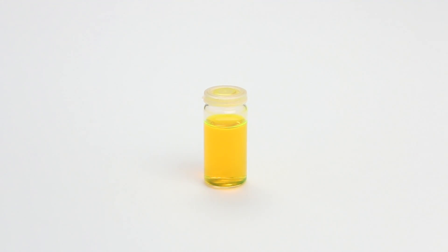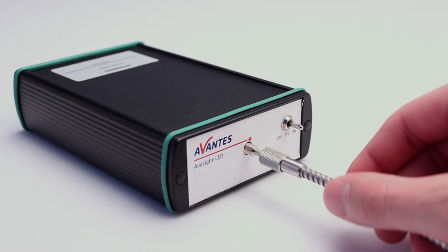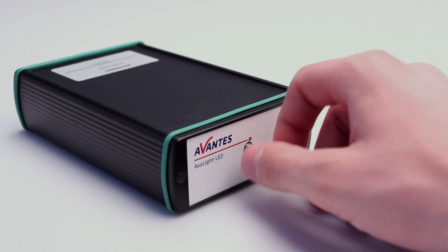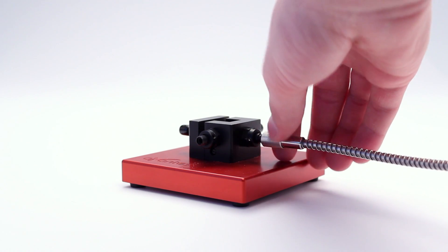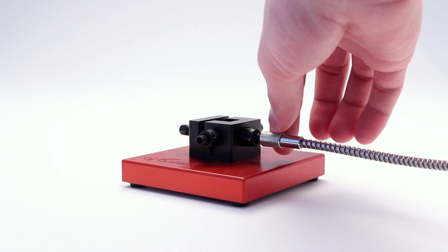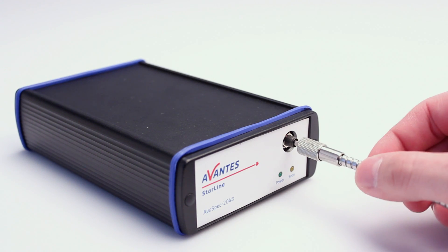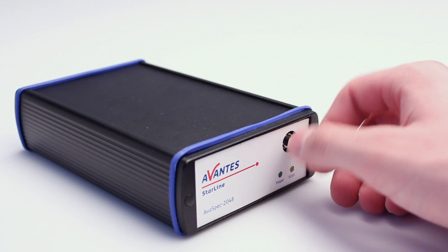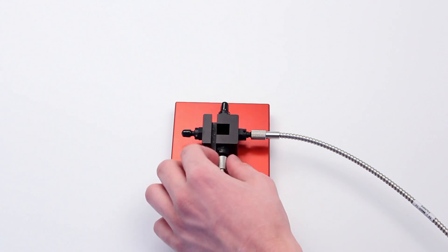In this example we are measuring fluorescent water. Start by connecting the light source to the cuvette holder. Then connect the spectrometer perpendicular to the light source connection.